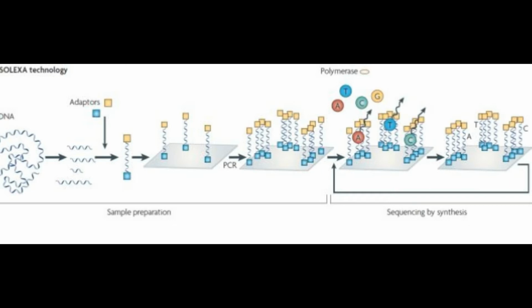And at that surface, it bends back in a manner that allows the reverse strand to start forming at the second point of joining. And this way we are able to create a cluster of multiple such DNA fragments.